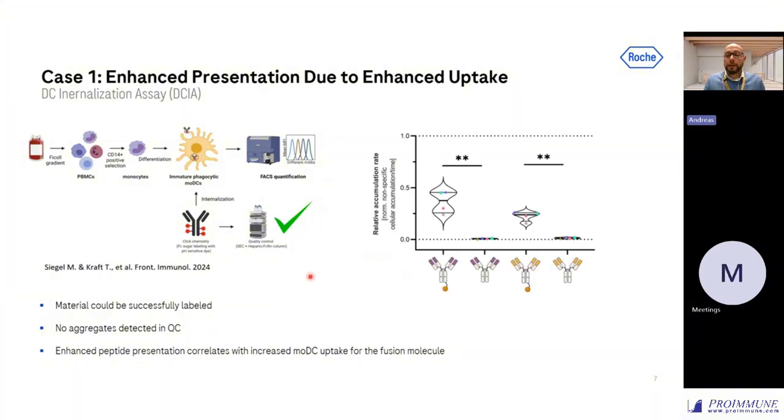And then here are the subsequent results of this experiment. Again, we have a baseline uptake. It's an arbitrary scale that has been established using an antibody and a modified antibody derivative that has a high uptake. That's where this arbitrary scale between 0 and 1 was generated. You can clearly see that the IgG1 parentals really behave as expected from a monoclonal antibody in terms of measured uptake in this assay. And as soon as we add the payload, we also see enhanced uptake.